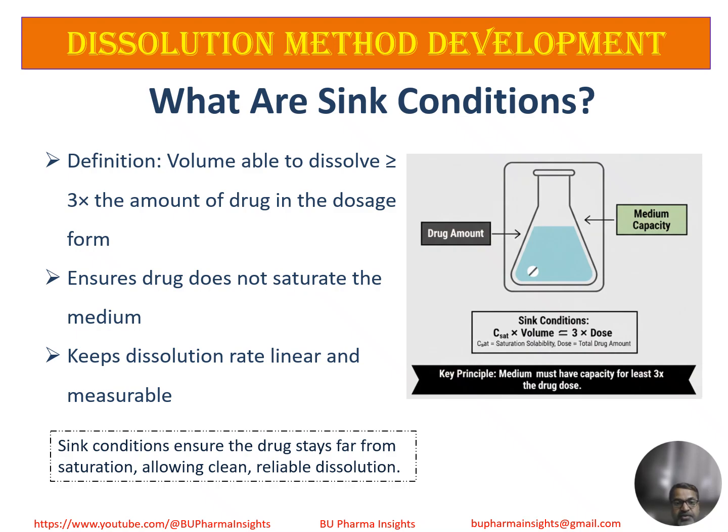Sink condition means the dissolution medium has enough capacity to dissolve at least 3 times the total drug content. This prevents medium saturation, avoids precipitation effects, and keeps the dissolution rate linear and measurable. In short, sink conditions ensure consistent and reliable dissolution results.